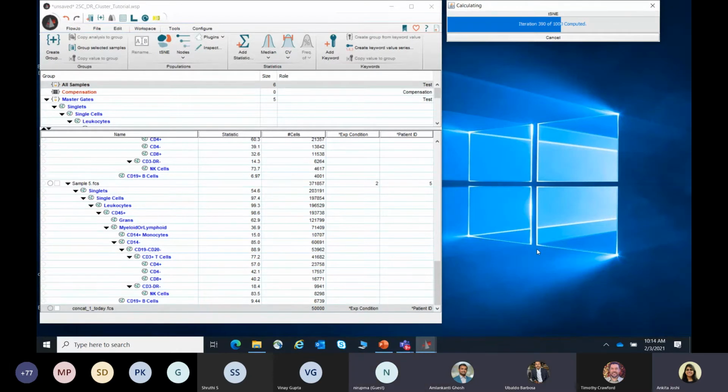I just wanted to ask Peter, what do you mean by our license? That it's a kind of a, that we have to purchase the R? No, no, no. The links were given, Dr. Nirupama, last time in the session. Those links are there and it was explained and we could send you the session. You don't have to purchase it. You have to just download it.